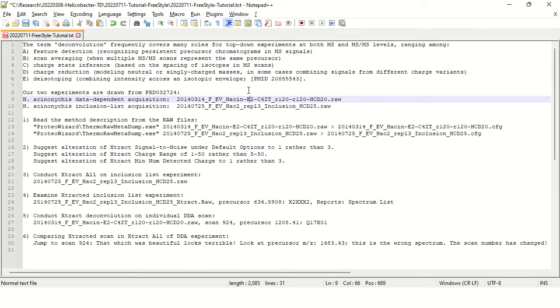You simply need to say, I want to grab tandem mass spectra of as many high-quality looking precursors as I can. So the data-dependent acquisition experiment is very similar to what we think of as shotgun experiments in bottom-up proteomics, except that the ions we're sampling here are not short peptides, but rather intact proteoforms, at least hopefully. The data-dependent acquisition experiment is one that we'll be looking at a little later in the presentation.